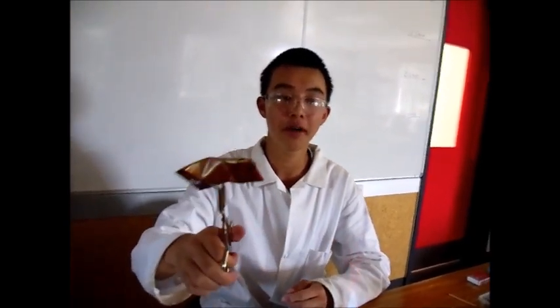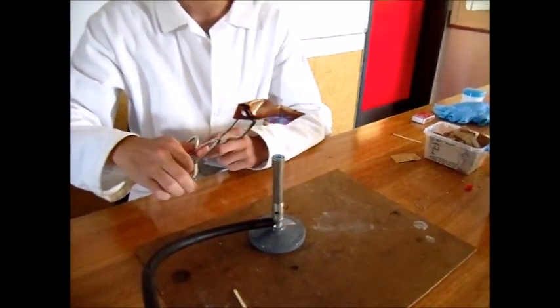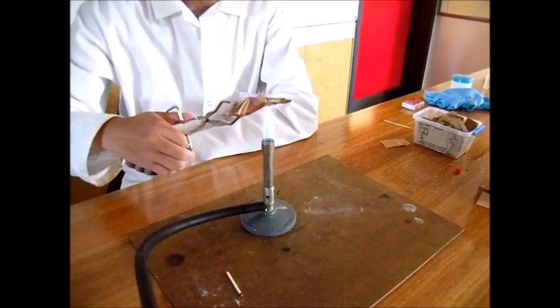We are going to put this copper into the hottest part of the blue flame, and it will react with oxygen from the air. However, this reaction is rather slow, should take around 5 minutes.